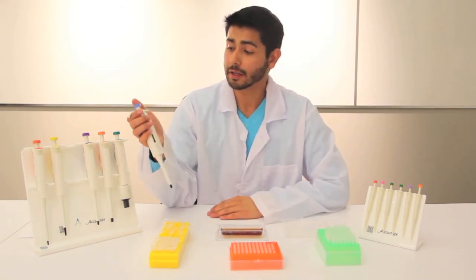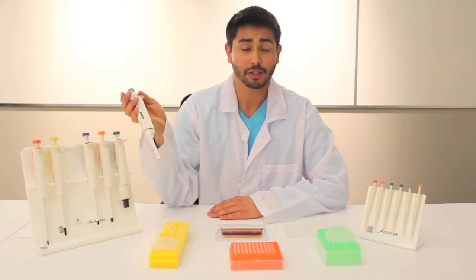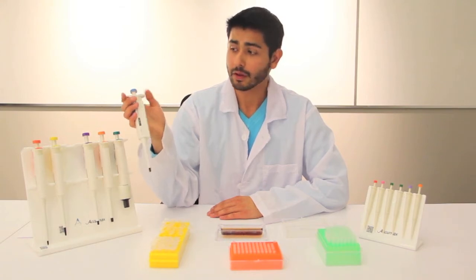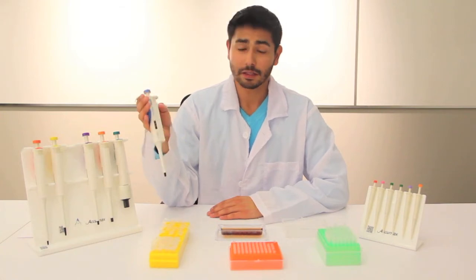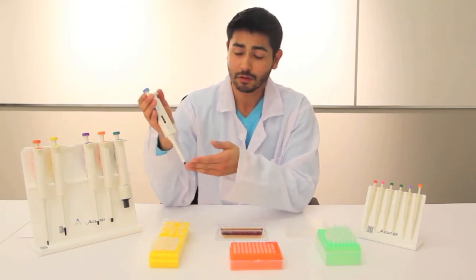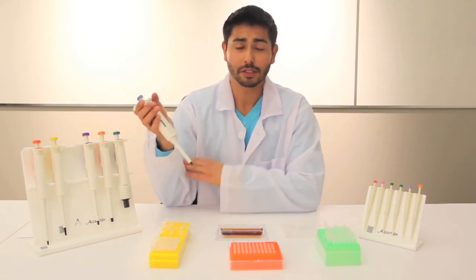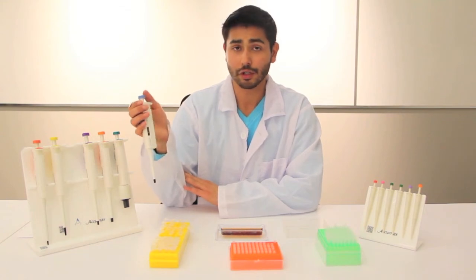Like traditional pipettes, they feature a tip ejector right here — with the thumb you just press it down and the tip will pop off. Another difference is that this pipette is not fully autoclavable; only the bottom manifold is. So what you do is just pop this bottom part off, stick it in your autoclave, and once it's sterilized, you can just stick it back on and you're good to go.